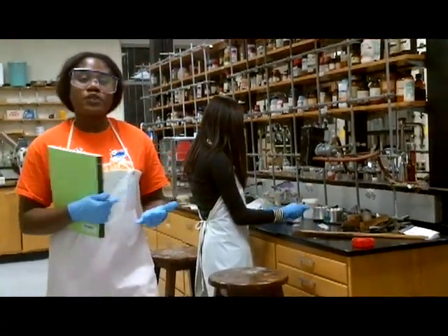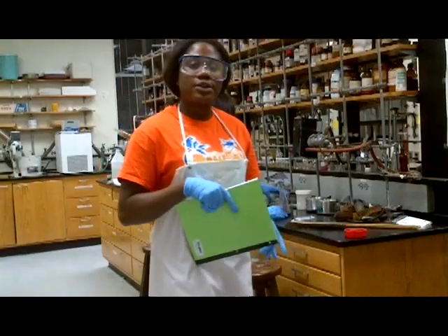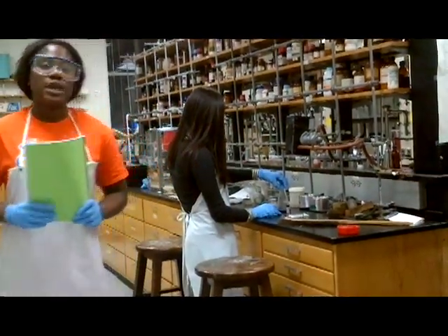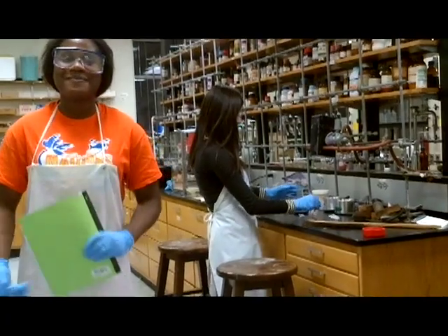This video is going to consist of 4 sections. First one is going to be on lab attire. The second one is going to be on safety. The third is going to be on lab etiquette, and the fourth is going to be on hazards. For this first part, I have with me here Denise, and we are going to start this video.